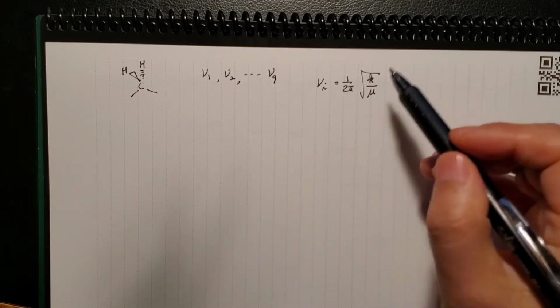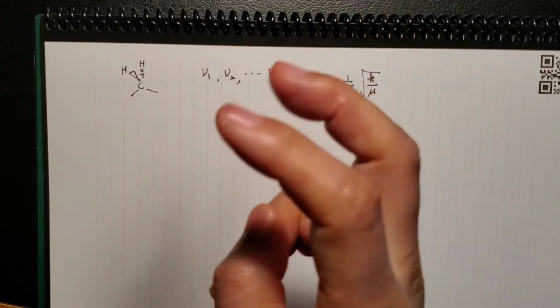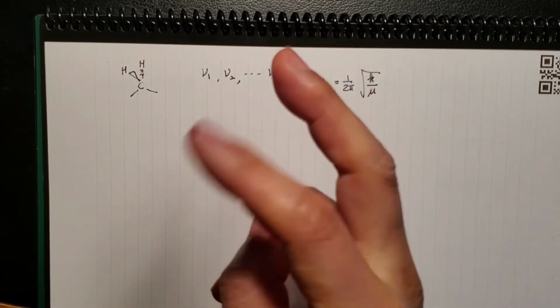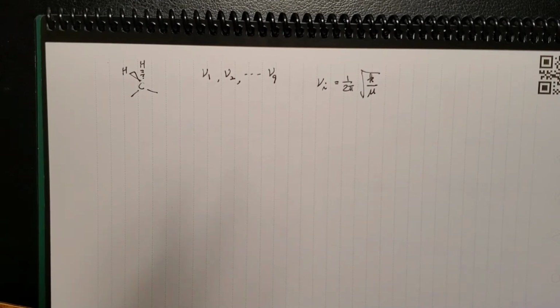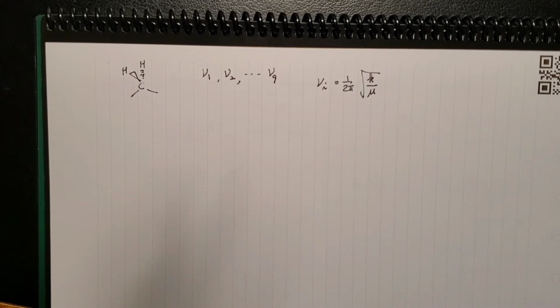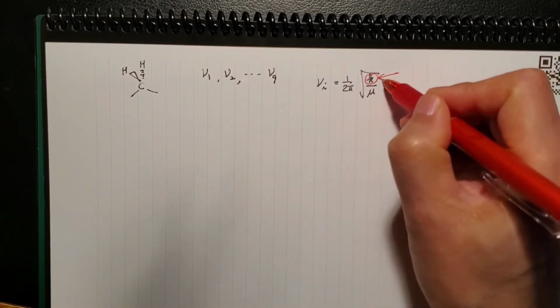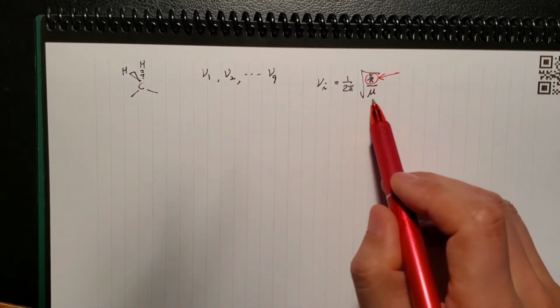Meaning the only difference you have is the K value, the force constant. The force constant is how much force you need in order to change them, right? So in each mode, you are changing the motion of the same mass. Which one is more difficult or easier to do determines the frequency. So different x values on the IR spectrum will eventually tell you this, for the same functional group, since it has the same reduced mass.